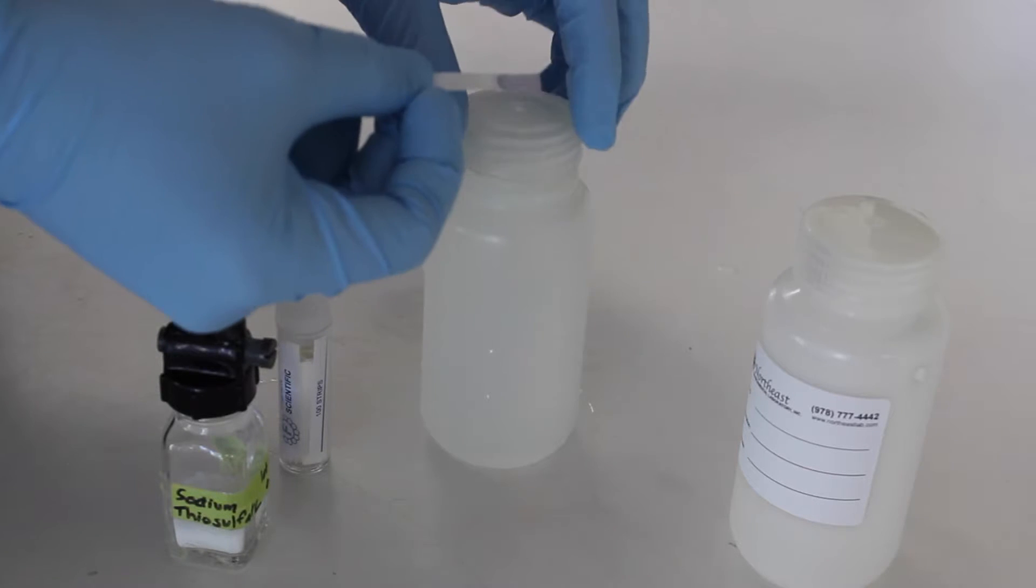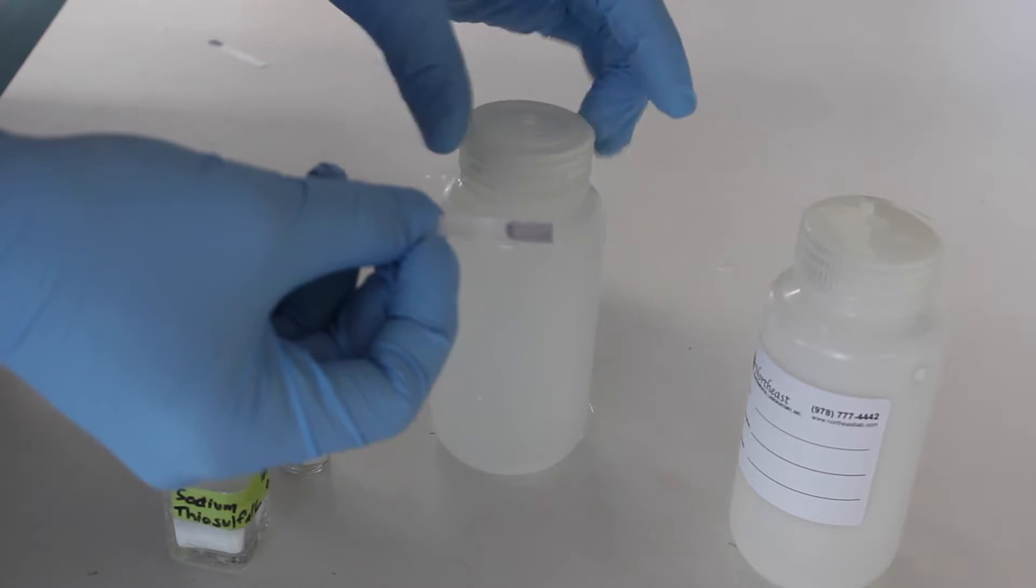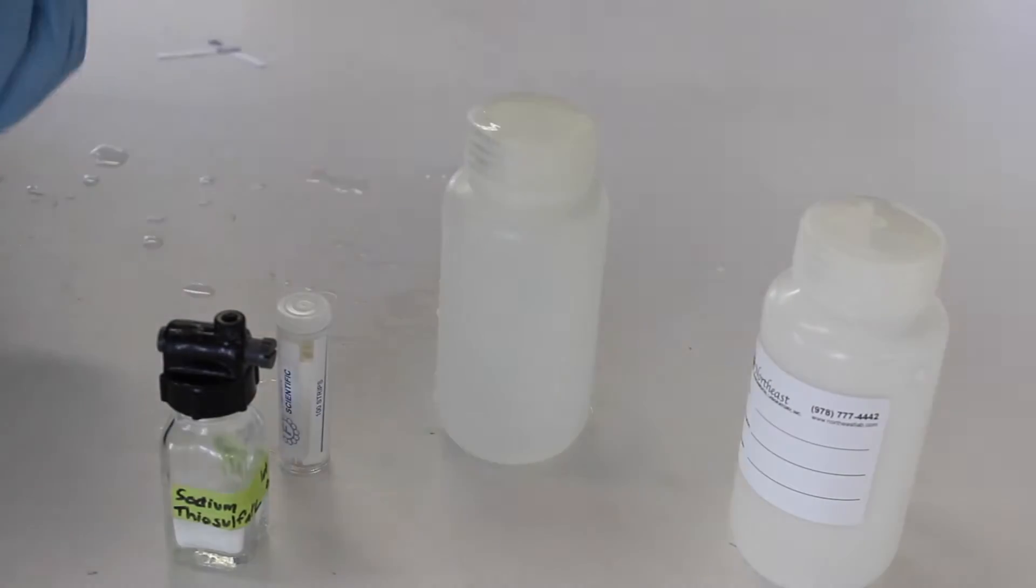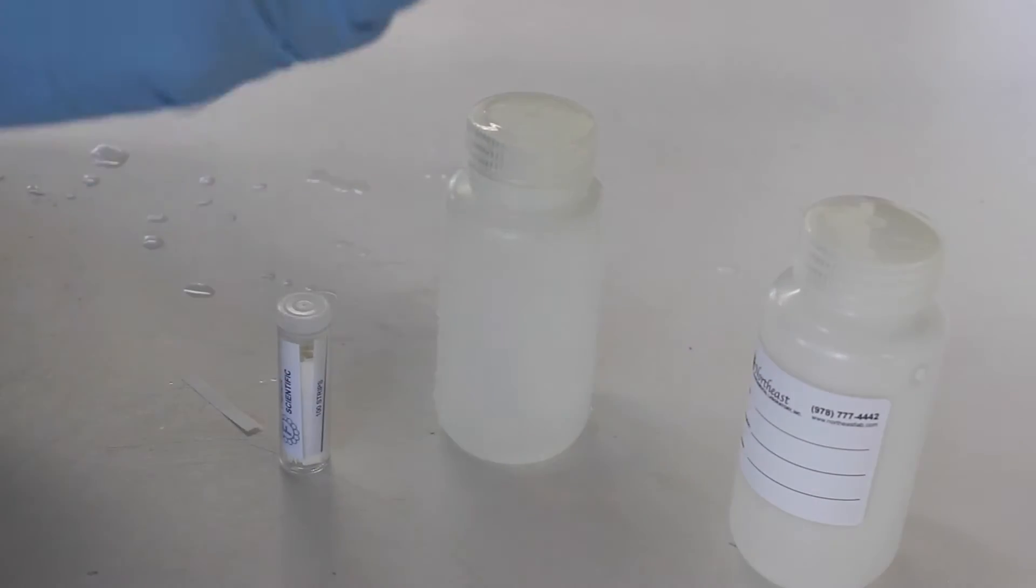Once you've collected your sample, test it with a potassium iodide test paper. If the paper turns black, indicating the presence of chlorine, add sodium thiosulfate and mix well.